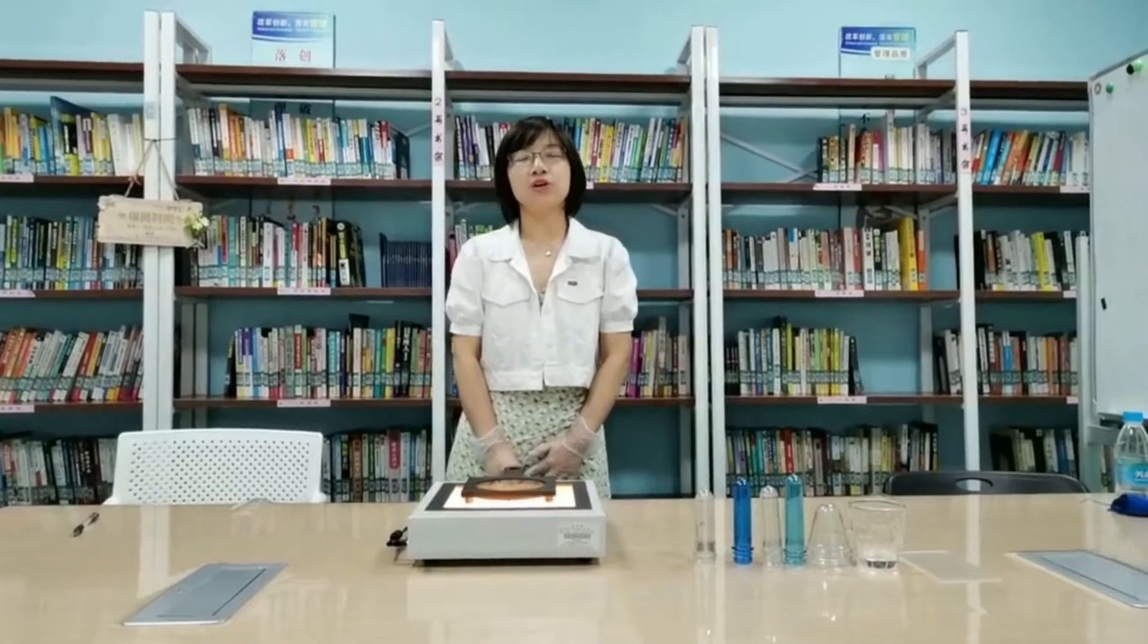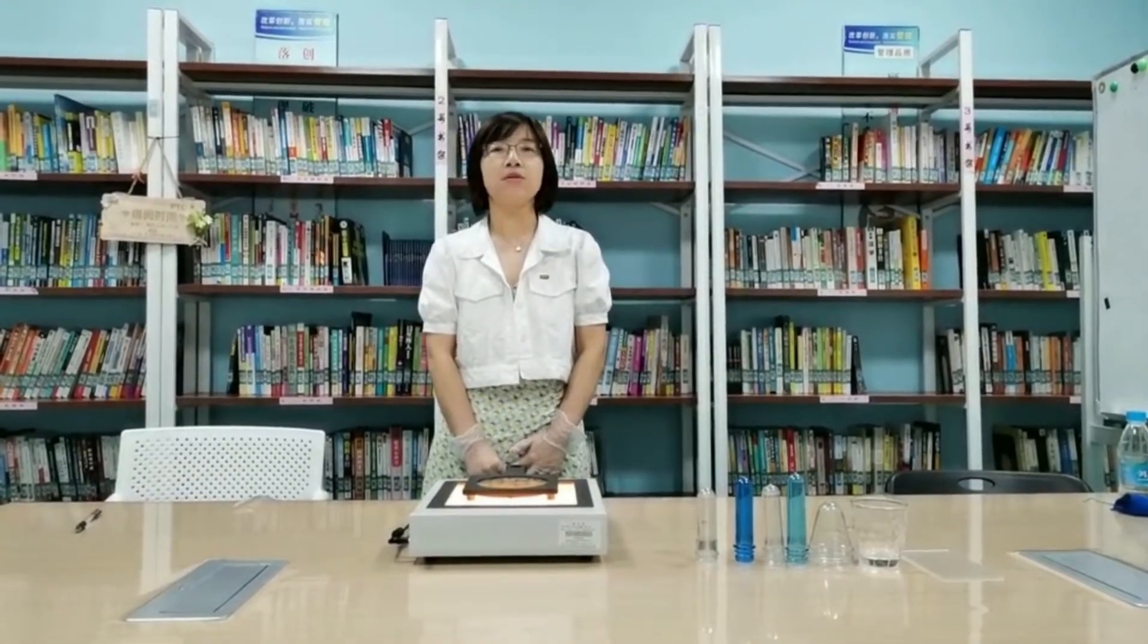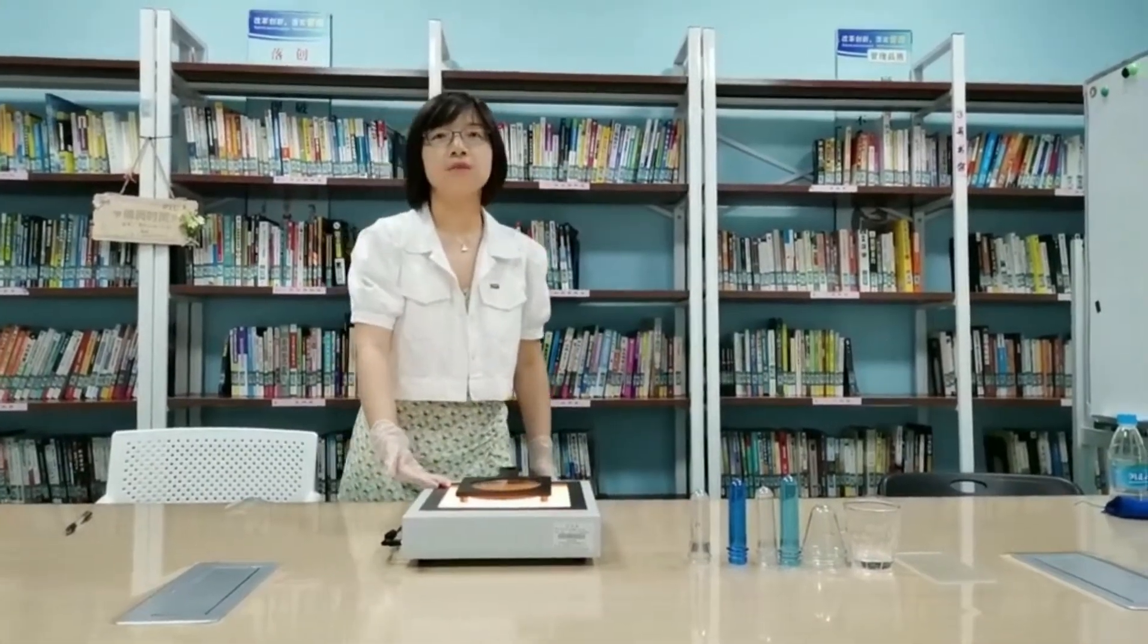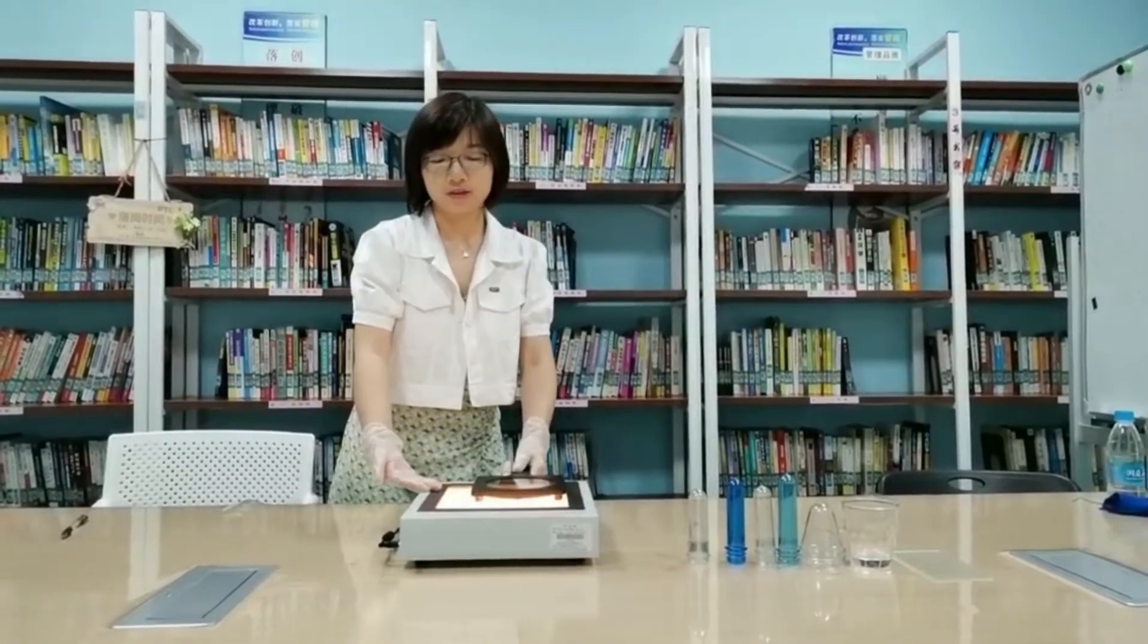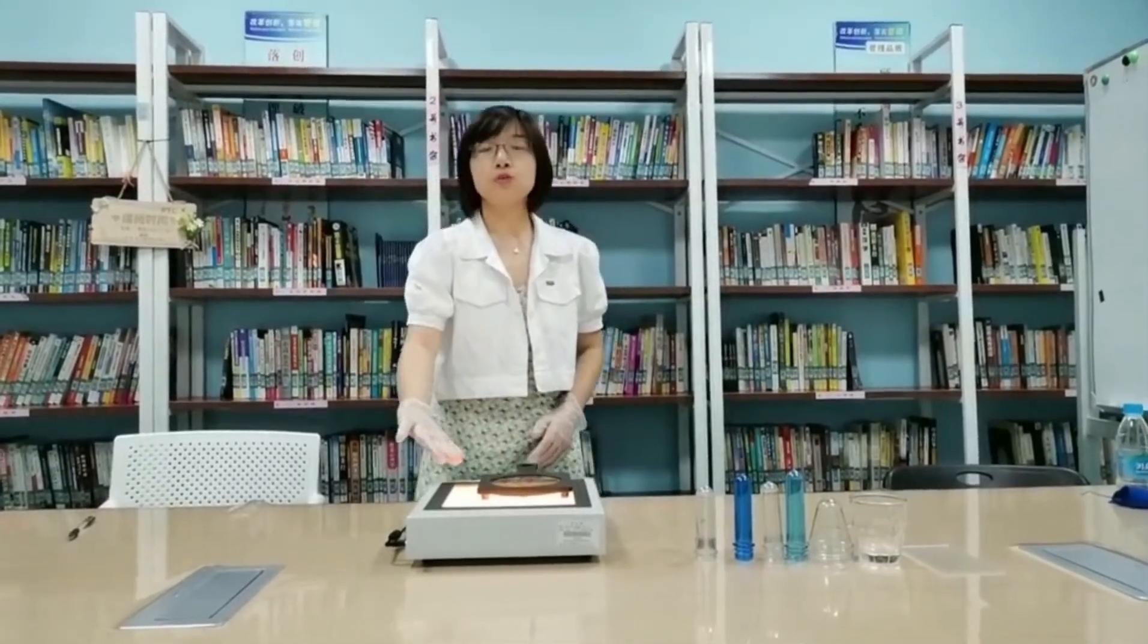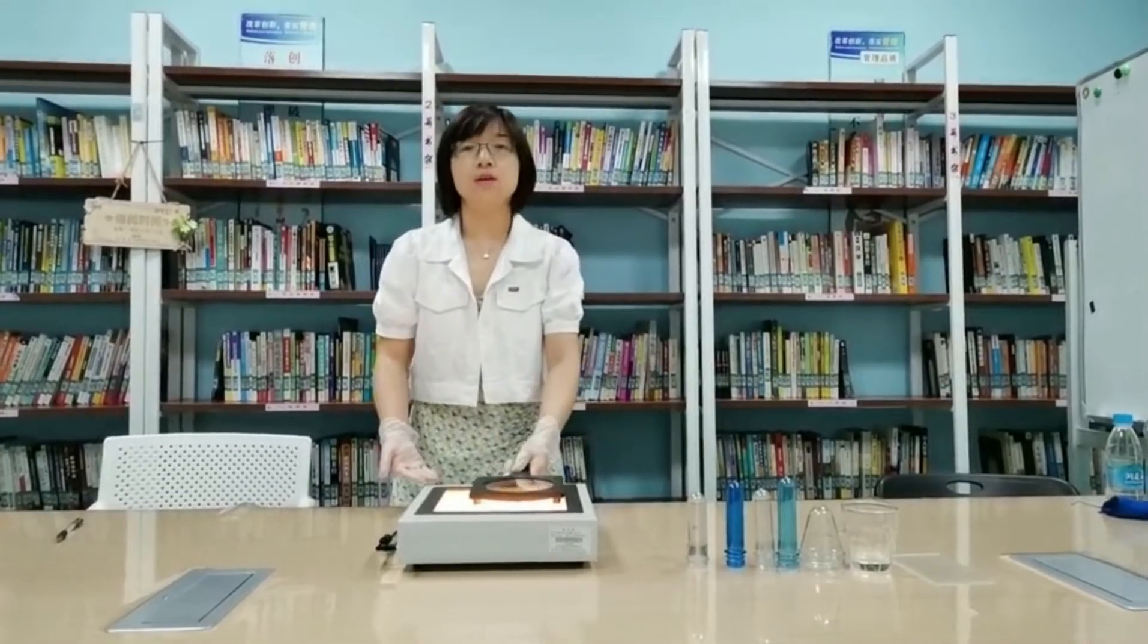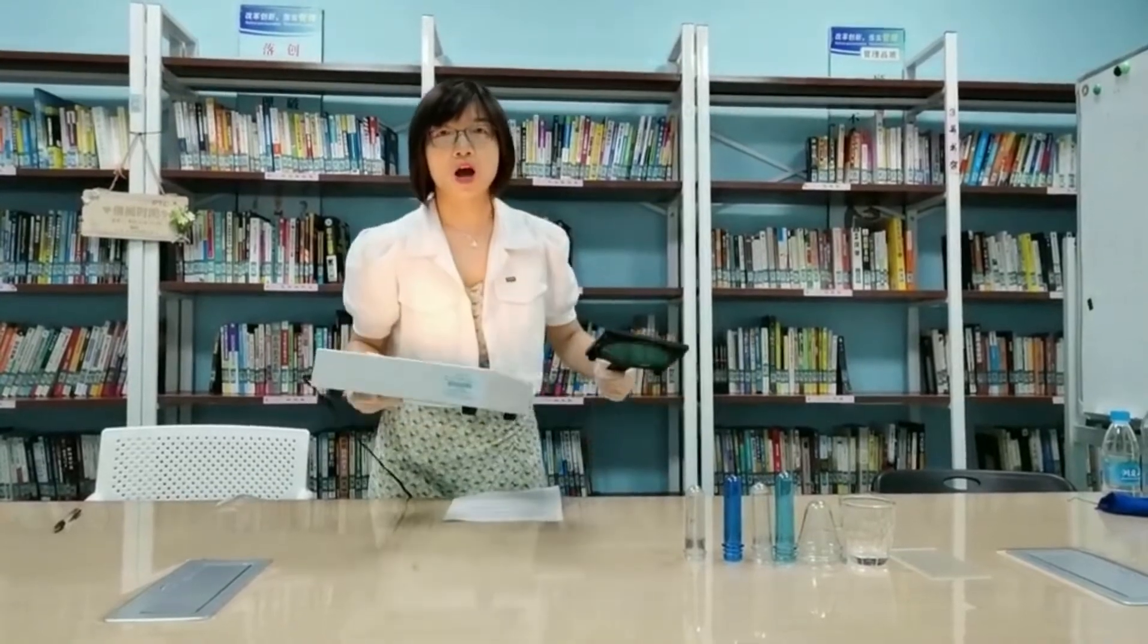Today, we are going to explore the magic of a new handheld polariscope. As you can see, this is the whole set of handheld polariscopes. This is the analyzer and this is the polarizer. Different from traditional benchtop design, this new model adopts the breaking design, which means the analyzer and the polarizer are movable.